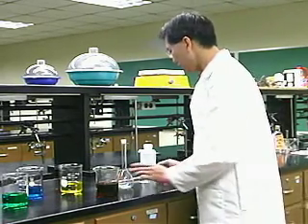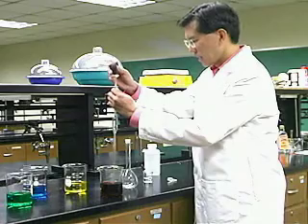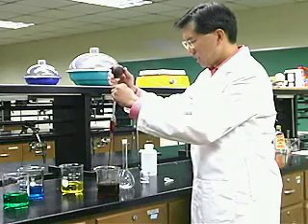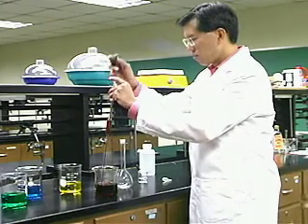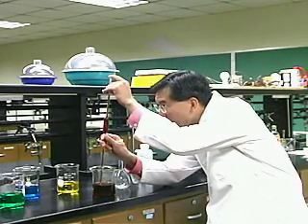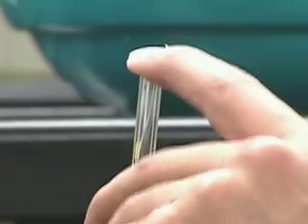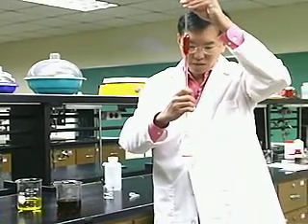We need to draw 20 milliliters of the red food coloring into the pipette. Use good pipetting technique. Draw the red liquid all the way up so that it's above the line, then get your eye down level with the line marked on the volumetric pipette. Allow it to drain down, and then transfer it to our volumetric flask.